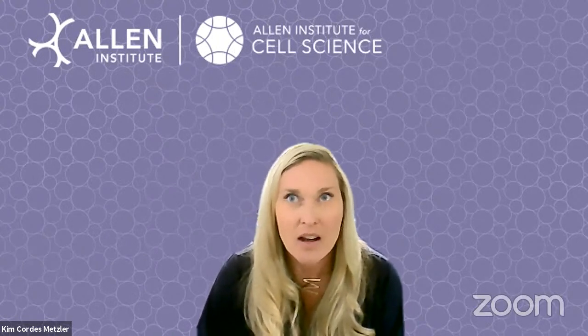But then the second part of the question, remind me, Caitlin. How do we confirm precise editing? Yeah, so we confirm it by using that method. By using the junctional PCR and ddPCR, we can confirm the copy number of the GFP that's there.